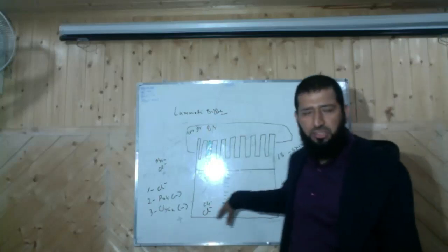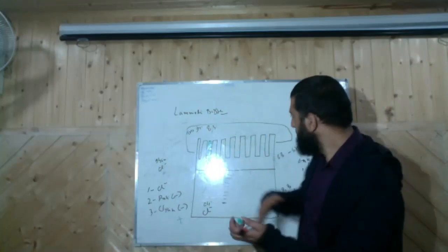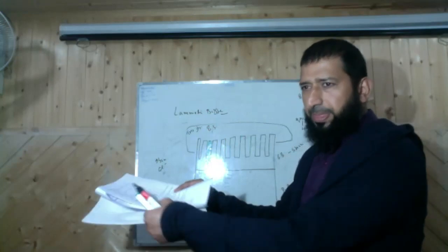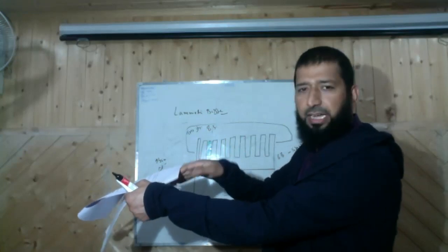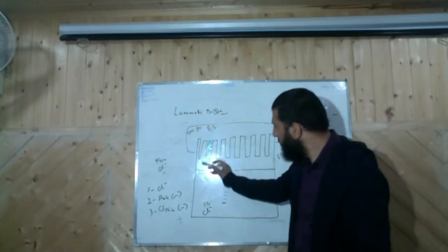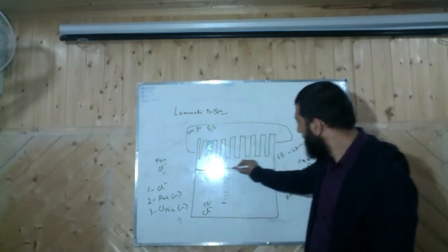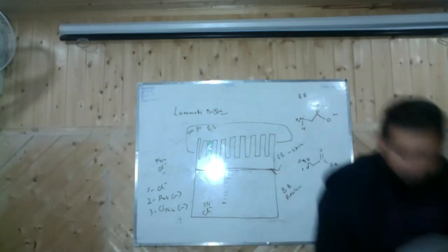Now, once you run the gel, take it out from the electrophoretic apparatus, and with the help of the spatula, you put that spatula in between the glass plates, and slowly tilt it so that these glass plates will separate, and on one of the glass plates your gel will be stuck. Then you can slowly, with the help of a spatula, we do not require this stacking gel now. We'll simply cut it out, and mark the gel so that we know which side is which.